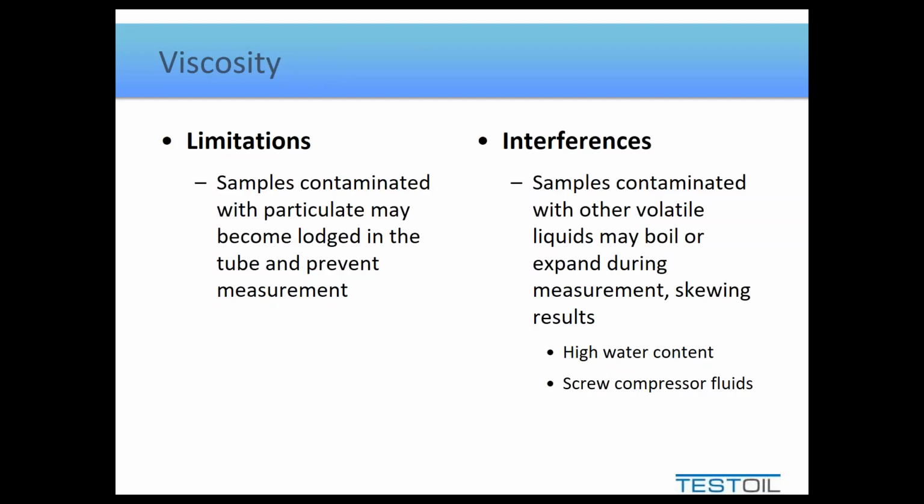This is a slow process, and depending on how loose the lid is and what you're doing with it, you may be introducing some contamination to that sample. So for any other measured parameters, it might not be as accurate. The more conventional way of degassing a sample would be through sonication, using an ultrasonic bath similar to how they clean jewelry and tattoo needles and all those other similar applications. High frequency vibration will help shake the bubbles out.